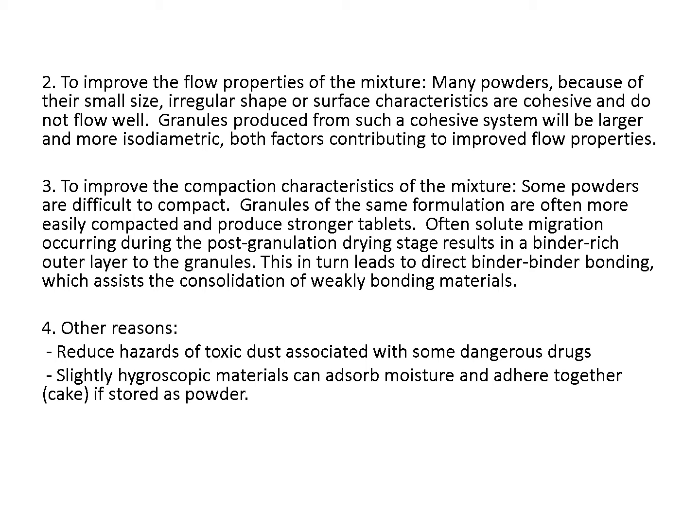Other reasons: if we have fine powder of hazardous toxic materials and it moves during manufacturing, it will form a dust. That dust is very dangerous to the working people. They can inhale it. Also, there is a loss of active ingredient and contamination. So by transforming these fine powders of hazardous drug into granules, the tendency of dusting will be less, with less toxicity, less contamination, and less loss of the active ingredient.